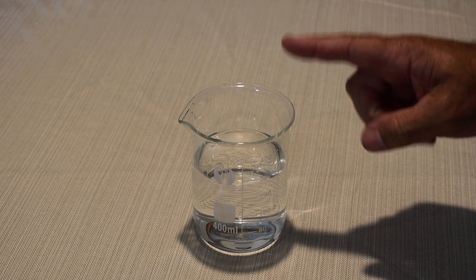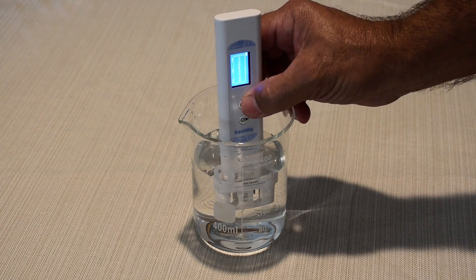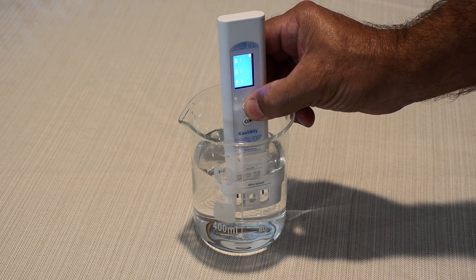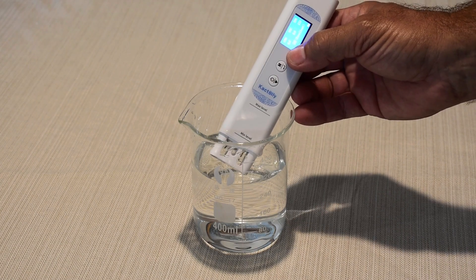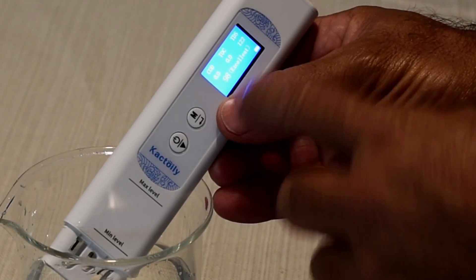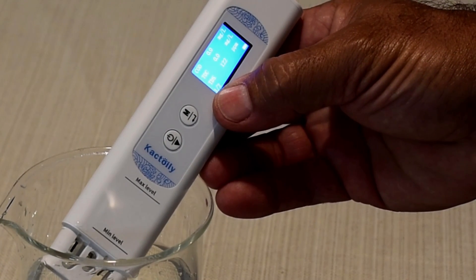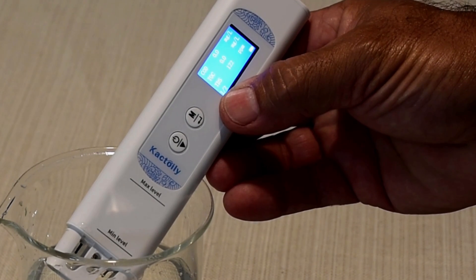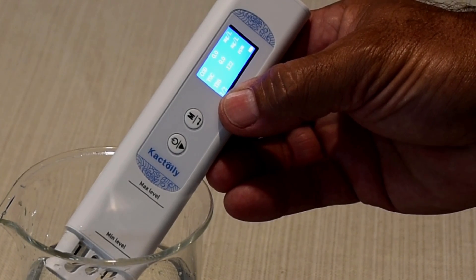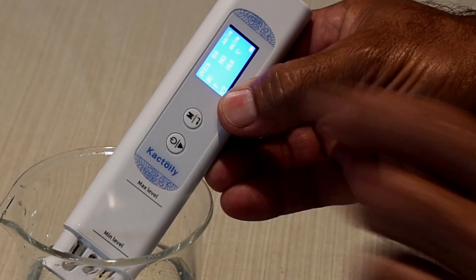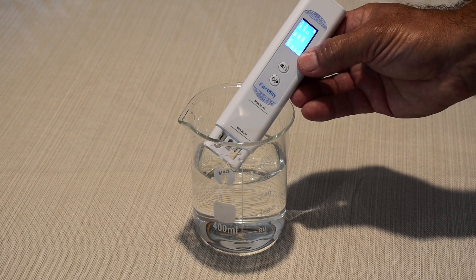Okay, now this sample here is from my water purifier. Let's see what kind of a change it has in my tap water. All right, so I had 80 before. Over here it says 98, excellent. COD and TOC are wiped out. Before COD was 2.26 and TOC was 3.07. Total dissolved solids slightly higher. UV-275 is 0, excellent. Electrical conductivity is very similar to before.